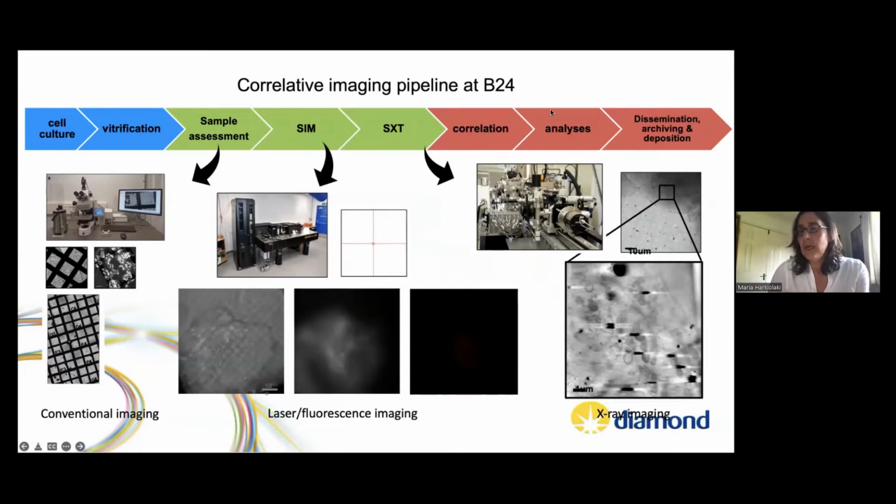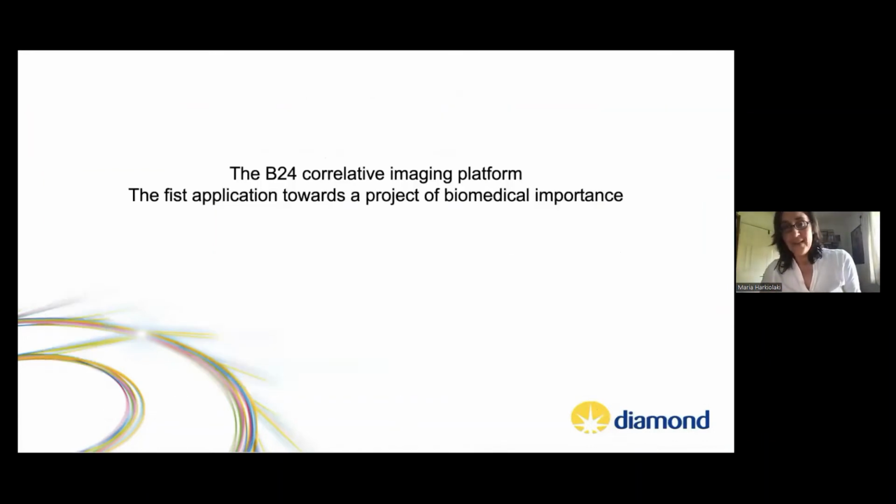I need to point out also that after that, there's a substantial in silico path that we follow. We've managed to automate data processing, so reconstruction happens automatically. In most cases, if the fiducialization is poor, then you still need to do it manually. And we also have 3D correlation scripts. So I believe, to the rest of the 3D volume imaging community, we're actually ever so slightly ahead, in being very kind and very helpful to us and our users.